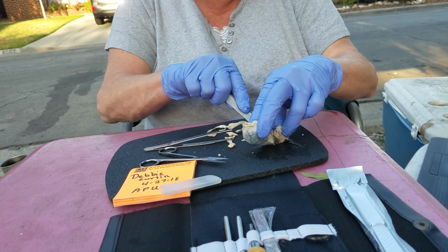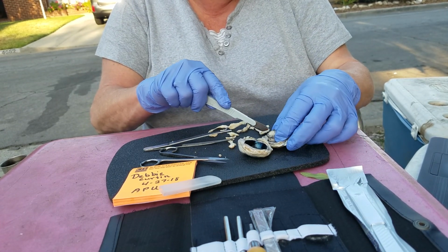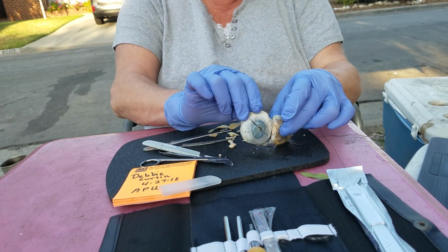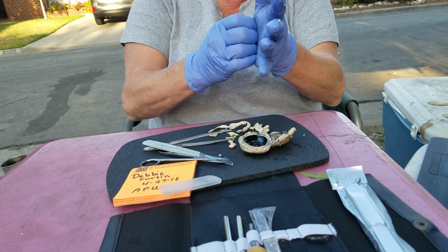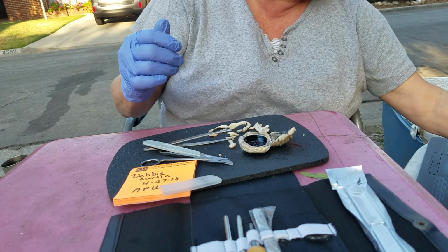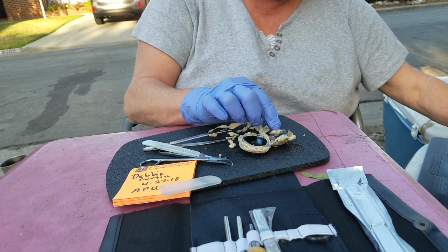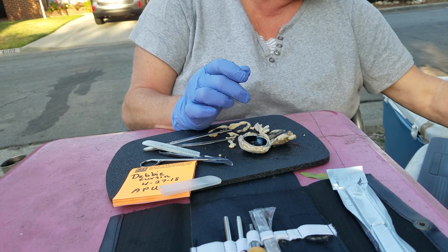There's some pretty colors in there, some shiny blue. There's also this very large hard piece in the center here. We've drained all the fluid from the eye. And now you can completely see the interior of the eye. That thick mass is the vitreous body here. You can actually take it out and see it and feel it. This one is kind of clumped and hardened a little more. If this were fresher, it would be more gelatinous.